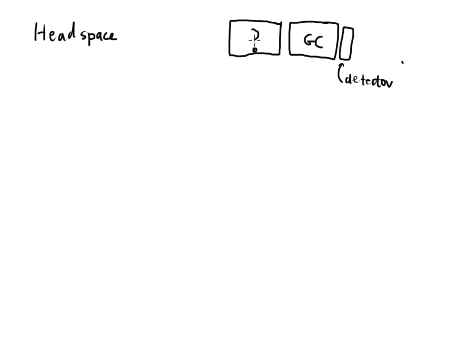And we can have various attachments. If I was in the kitchen and I bought a nice new swanky KitchenAid mixer, that mixer can do more than just mix cake batter, right? So I would purchase these attachments and attach them to that mixer, and then all of a sudden I could have a meat grinder instead of a batter mixer. So my usage of that instrument somewhat changes.